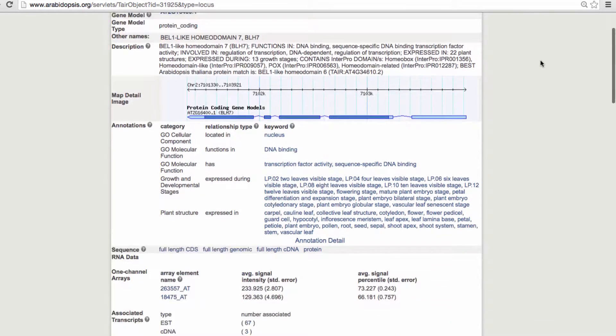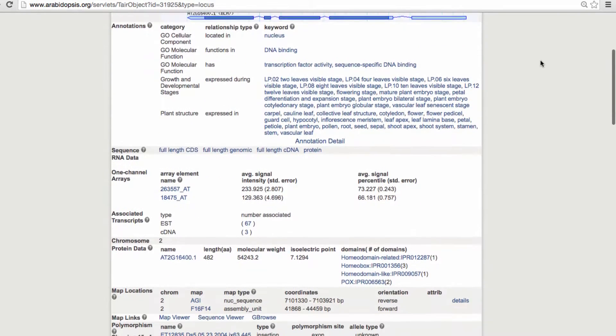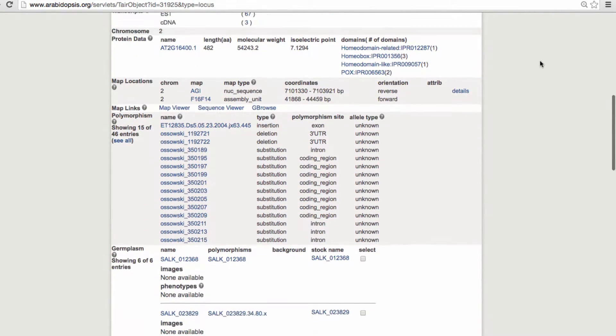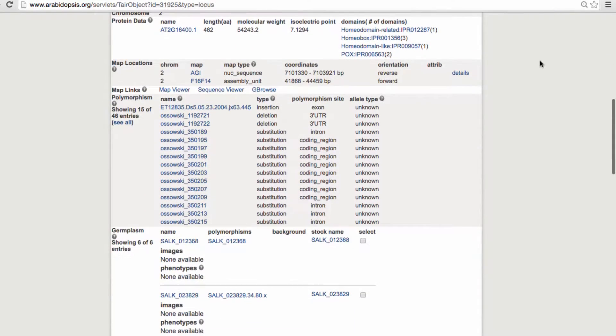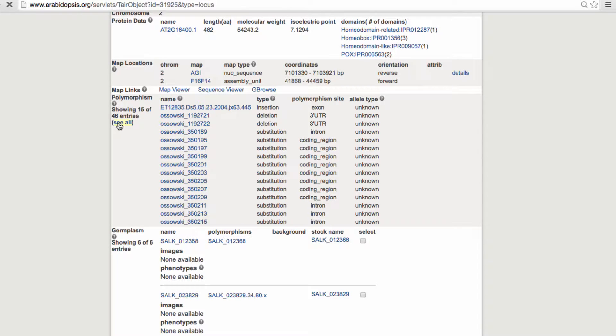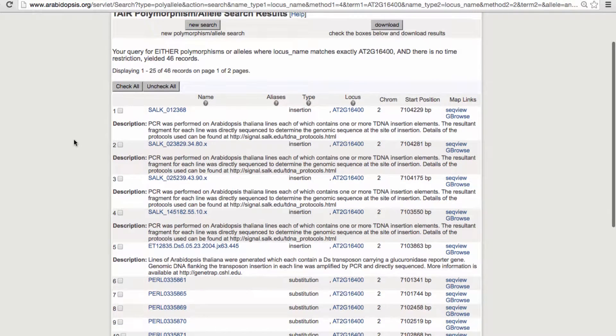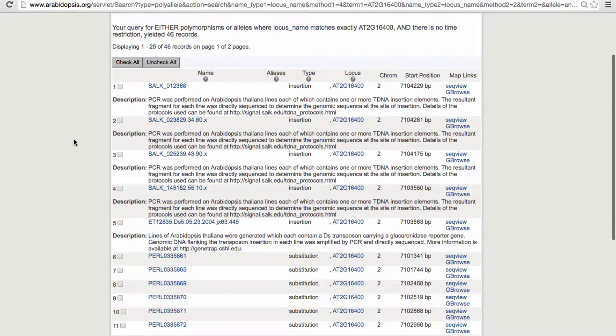Flank sequences from the Salk, WISC, or other collections are captured in TAIR as insertion polymorphisms. The older Sanger flank sequences have been mapped to the genome assembly and can be found by searching within specific genes or by browsing the genome.